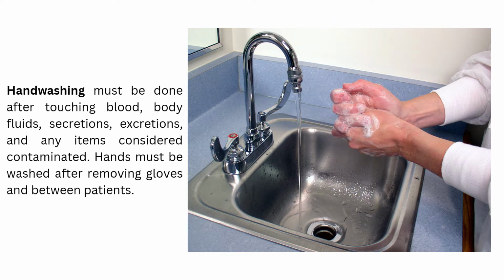So when do you exactly wash your hands? There are different moments where you are required to wash your hands. Those are the times when you touch blood, body fluids, secretions, excretions, and any items considered contaminated. Also, you are required to wash your hands after you don and doff your PPE, and when you move between patients.